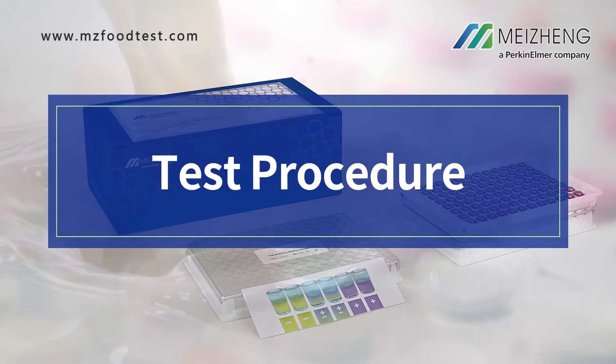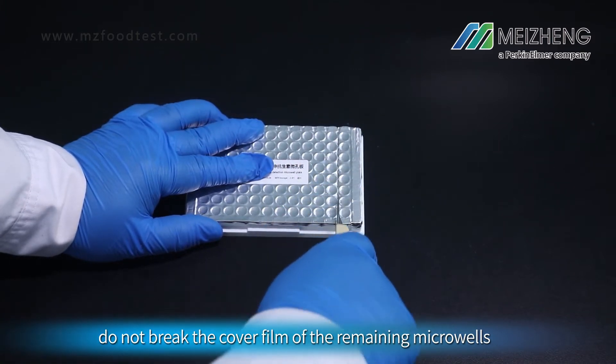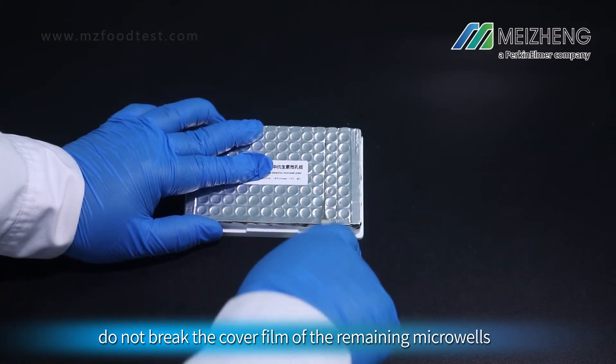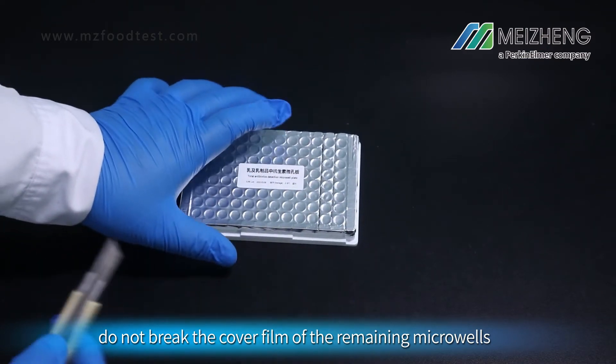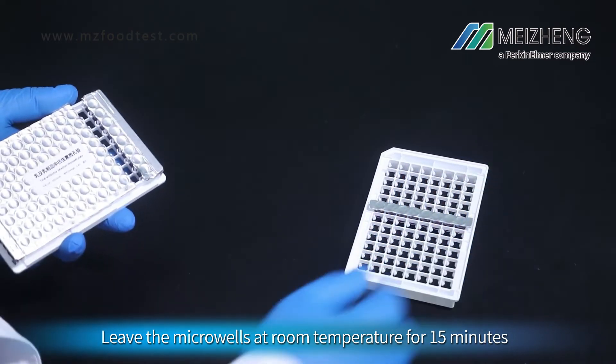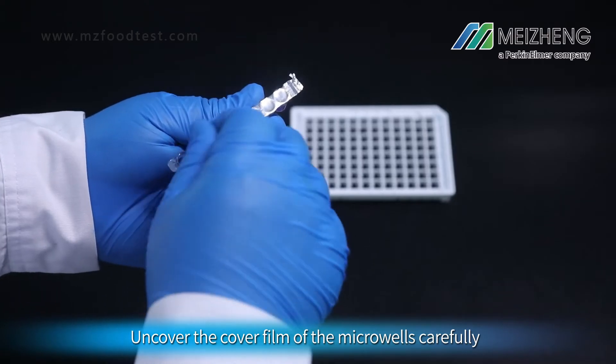Test Procedure. Carefully take the required number of microwells; do not break the cover film of the remaining microwells. Leave the microwells at room temperature for 15 minutes. Store the remaining microwells at 4 to 8 degrees Celsius immediately. Then uncover the cover film of the microwells carefully.